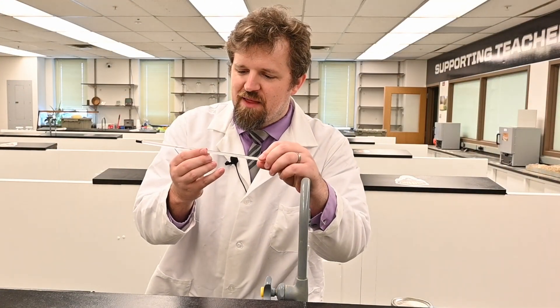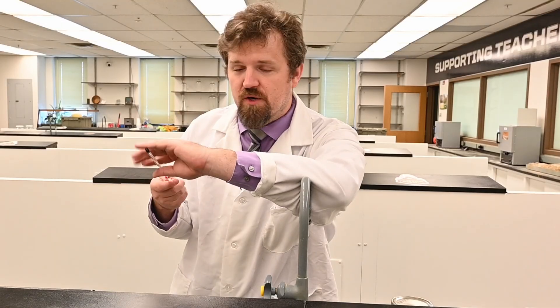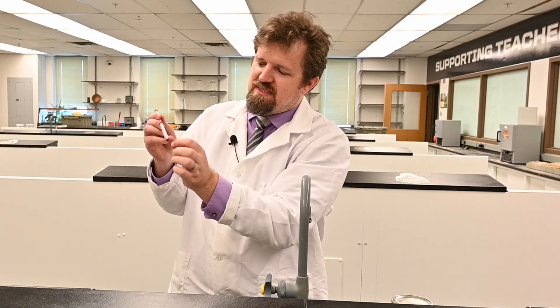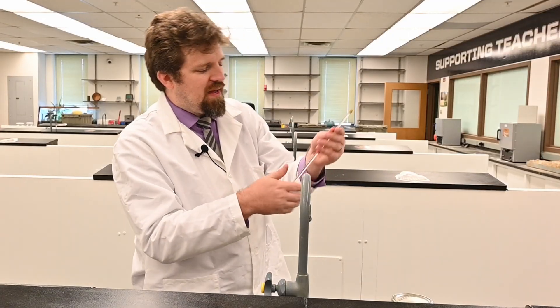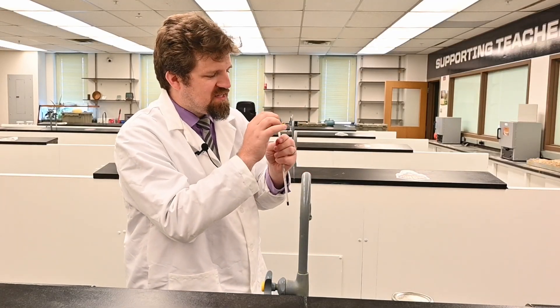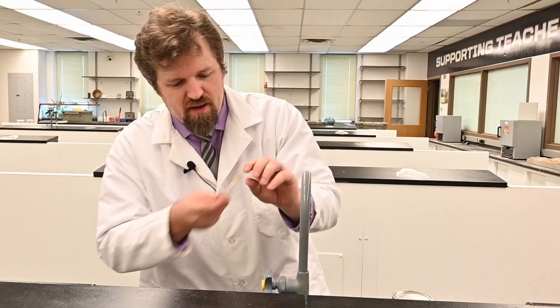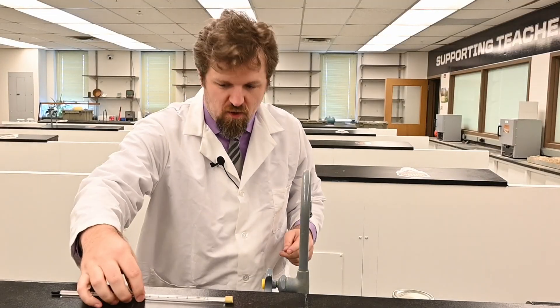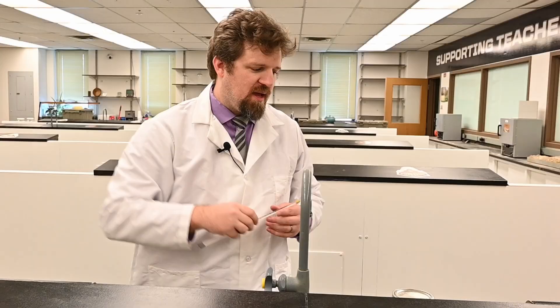You guys know what this is. This is a thermometer. Thermometers use just like the ones at that you would anywhere else. These ends are usually filled with, they used to be filled with mercury and you might've heard about that, but you'd be hard pressed to find a mercury thermometer in the lab you guys are in. You'll know it's mercury if the inside is a silver. This is a red liquid. That red liquid is usually an alcohol that has a relatively low boiling point, but anyway, it helps you measure the temperature in a certain way. Now, be careful. Once again, I can't emphasize enough round things roll. So if you place this on the counter, it can easily roll off, but the people who make this are already out thinking you. Sierra here, you can see a little plastic rubber triangle. And then they actually placed it on there. So that when it's on a surface like this, it won't roll off because the triangle keeps from doing that.